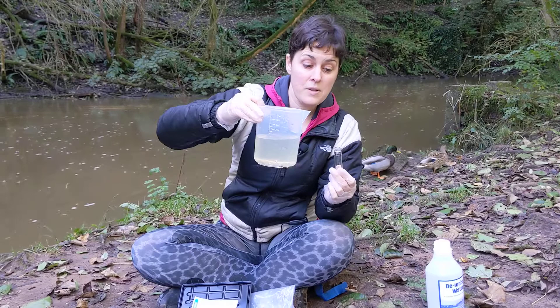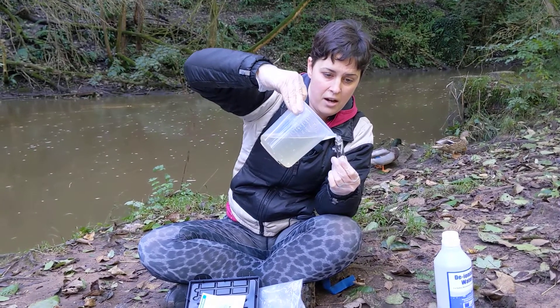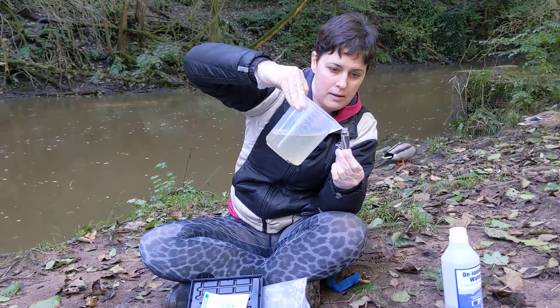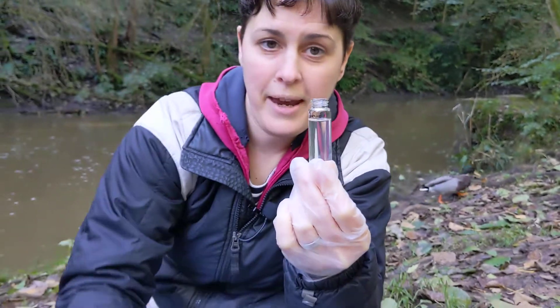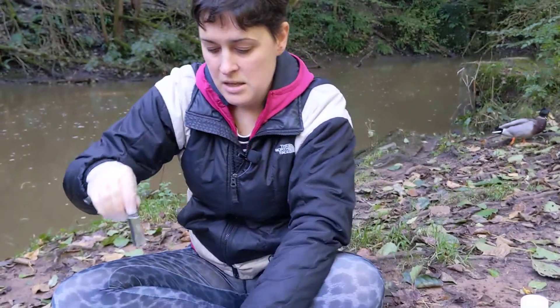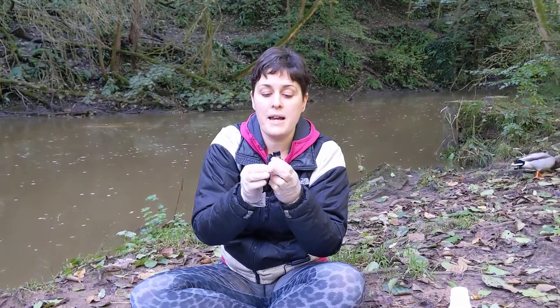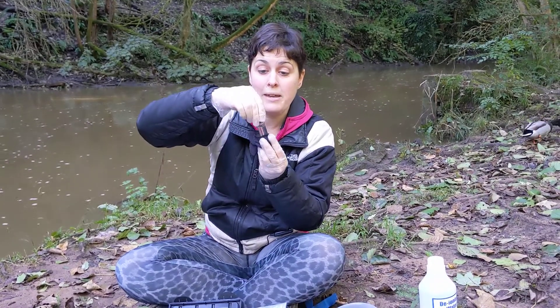When you're ready to take your sample, fill the cuvette up to the 10mm line. Then pop the cap on, and using a cloth or some tissue, give the outside of the cuvette a little bit of a wipe down to remove fingerprints. Then try and hold it by the cap.